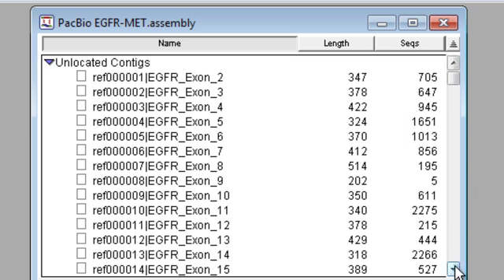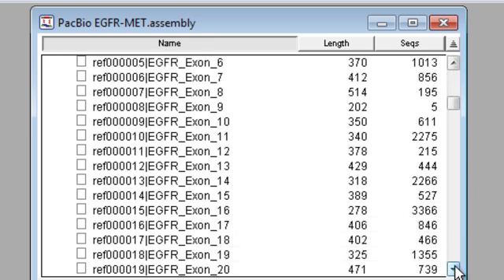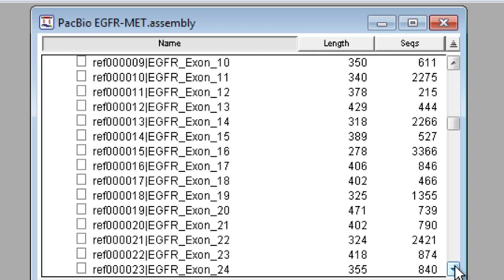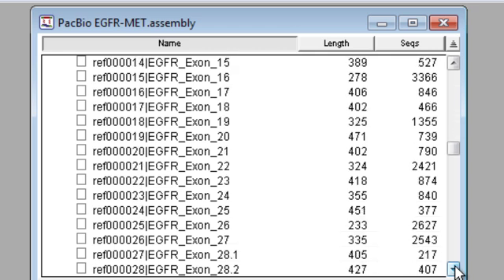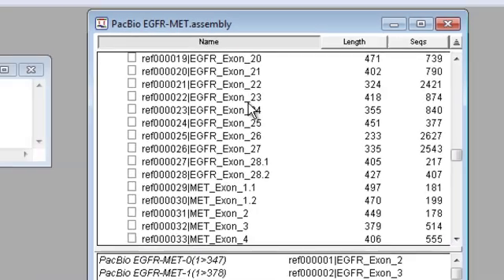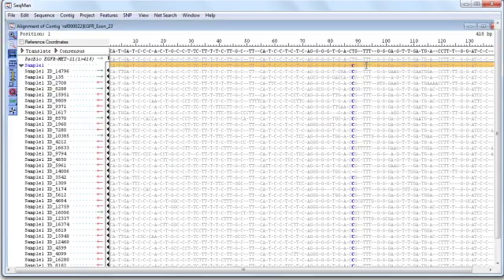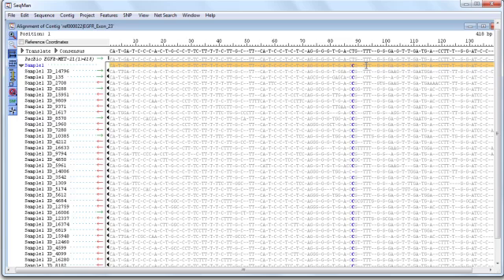As you can see, each contig in this assembly corresponds to a single exon in either the EGFR or MET gene. If I want to look at any of these contigs in more detail, I just double-click the contig name, and that opens the alignment view for that contig.